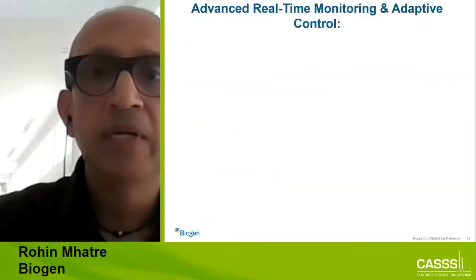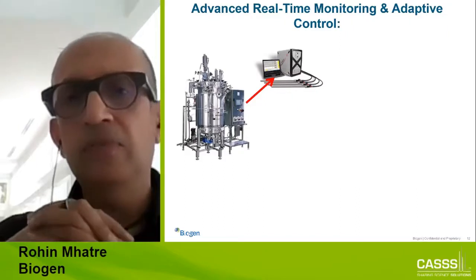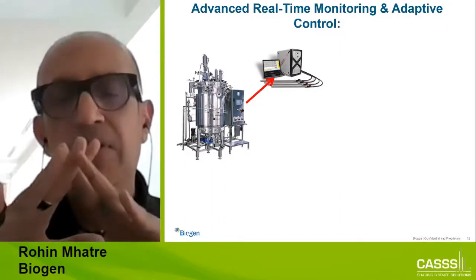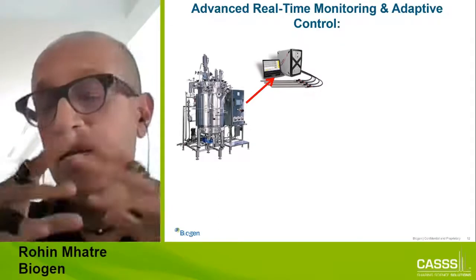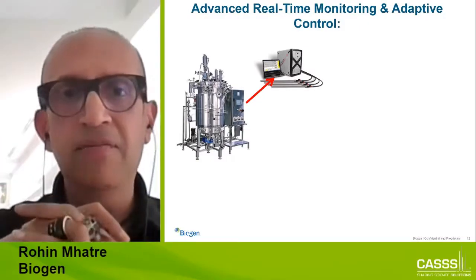Yeah. So here is an example for the upstream, just talking about basic tools. The tools in this case are very basic, whether you have a capacitance probe or, in this case, Raman probes. And that's a decades-old technology. This is nothing necessarily novel or earth-shattering here.